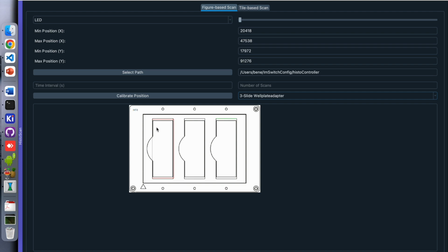And for this, we need to have a few pieces of information, and for this we then should meet with the microscope and all the software installed maybe the next time. Because one thing that's crucial is, is X connected to X? So this here is the X direction, this is Y. And so this could be the first issue, that the microscope's axes are not connected to the right ports. So that maybe, and then the direction. So this is plus, this is also plus, so 0, then here that's plus, and this is also plus.